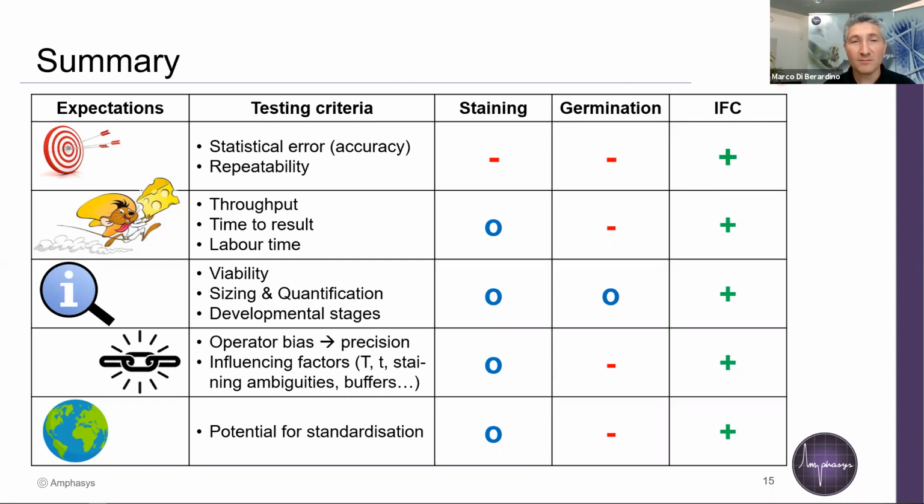So that's why I couldn't say that our technology would also discriminate vigor, but I would say that if our technology says that you have 50% viability, and you don't have, let's say, different maturation levels of the cells, you should get around 40 to 50% germination if you have the right germination protocol.